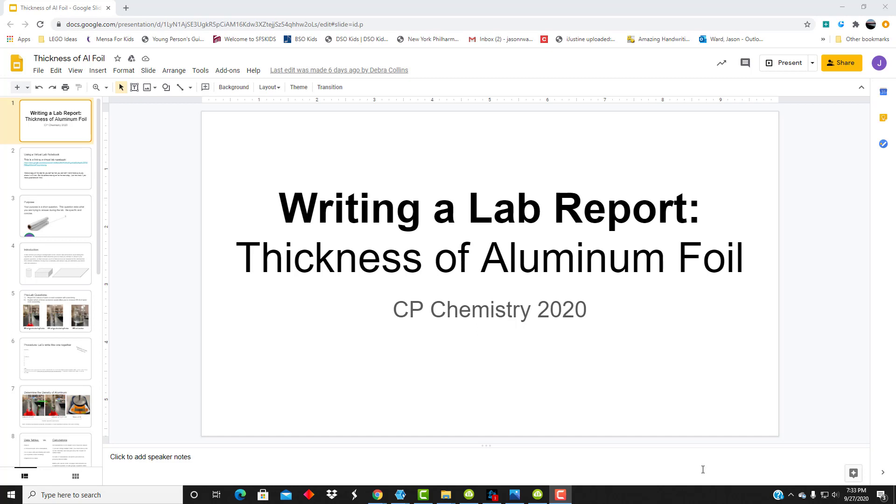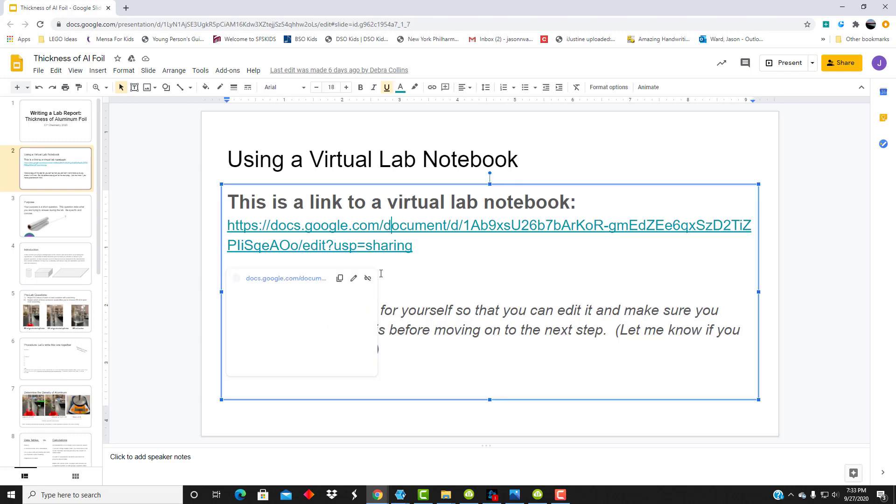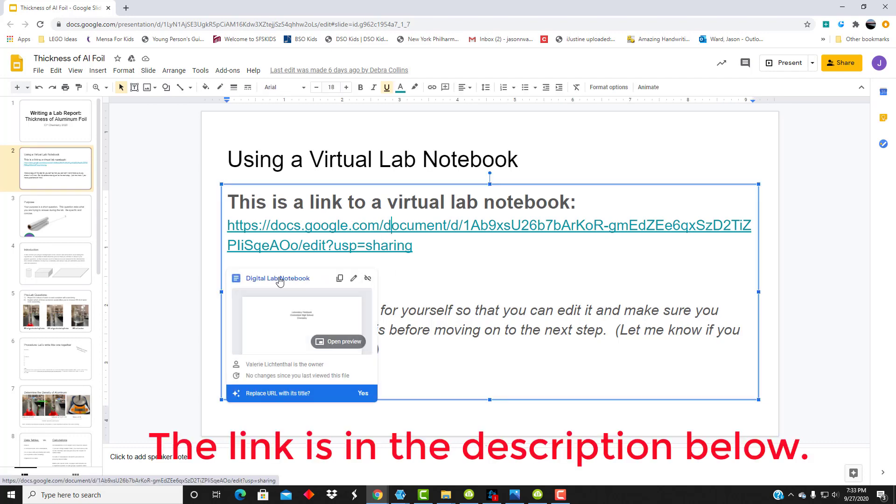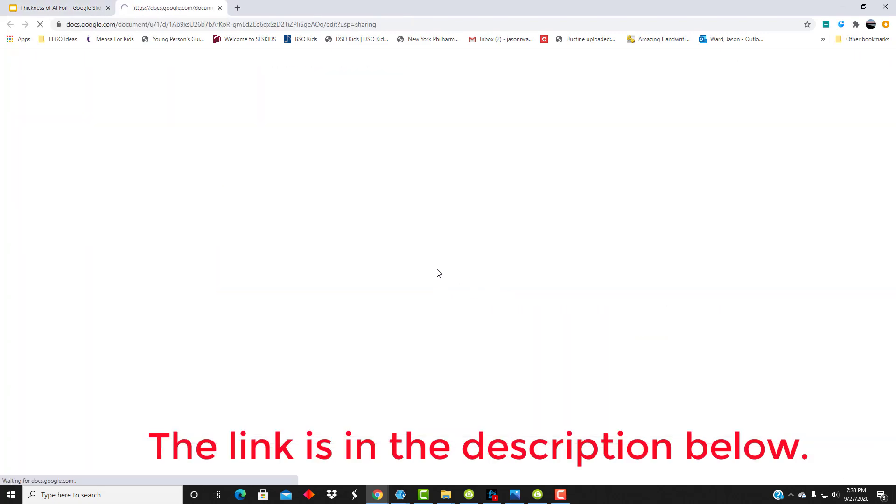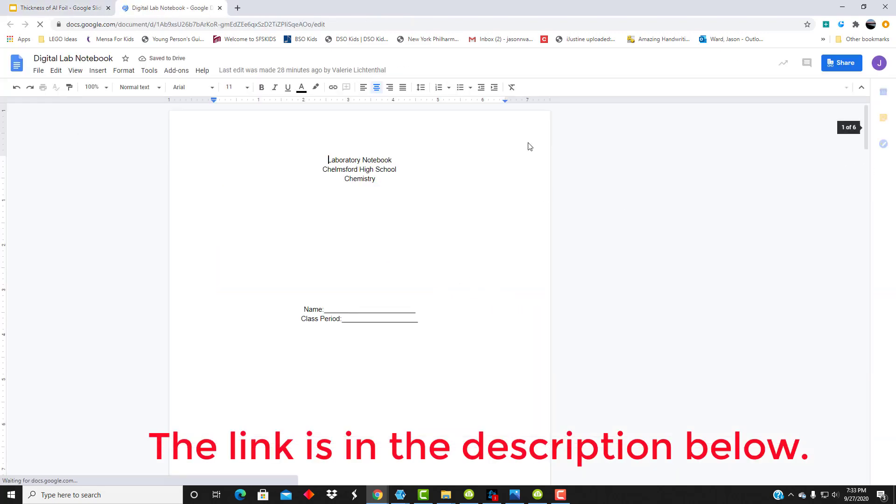So first of all, you're going to create your own copy of the digital or virtual lab notebook. So first, click on the link. That will open up this copy.